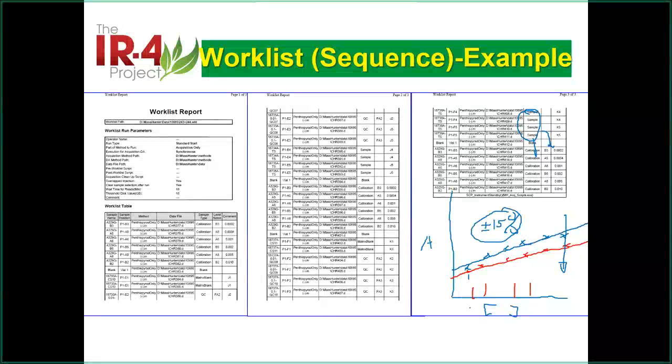And well, the best way is you calculate the R value or R squared value for the lines. You can calculate as one line, and the R squared value will change like this. Or you can calculate two lines, then use the intercept. What's the difference there?